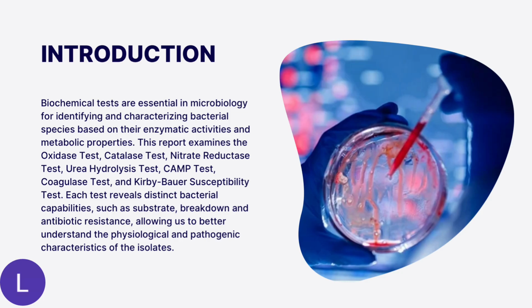For the introduction, biochemical tests are essential in microbiology for identifying and characterizing bacteria species based on their enzymatic activities and metabolic properties. This report examines the oxidase test, catalase test, nitrate reductase test, urea hydrolysis test, CAMP test, coagulase test, and Kirby-Bauer susceptibility test. Each test reveals distinct bacterial capabilities such as substrate breakdown and antibiotic resistance, allowing us to better understand the physiological and pathogenic characteristics of the isolates.